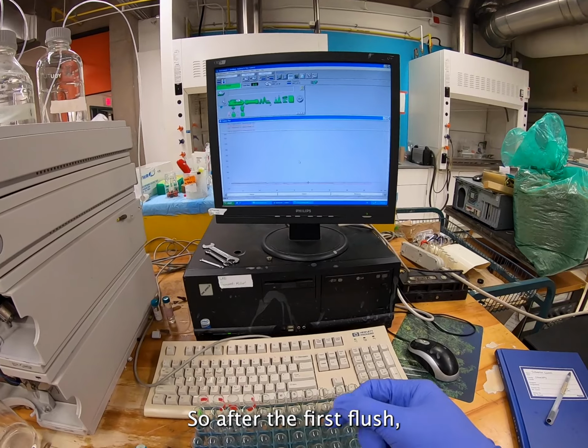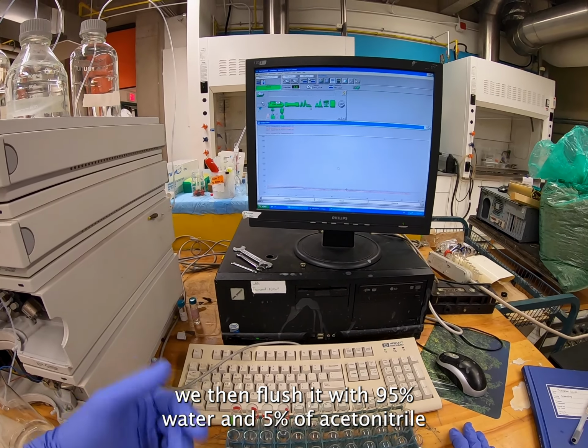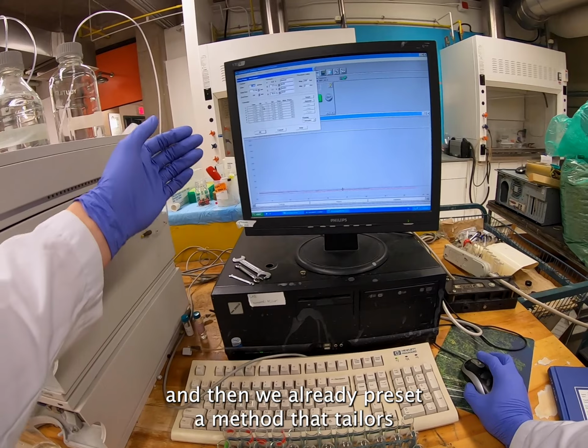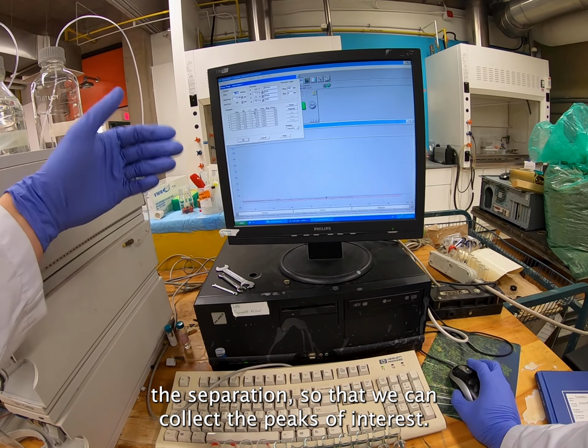So after the first flush, we then flush it with 95% water and 5% acetonitrile to return it to base conditions. And then we already preset a method that tailors the separation so that we can collect the peaks of interest.